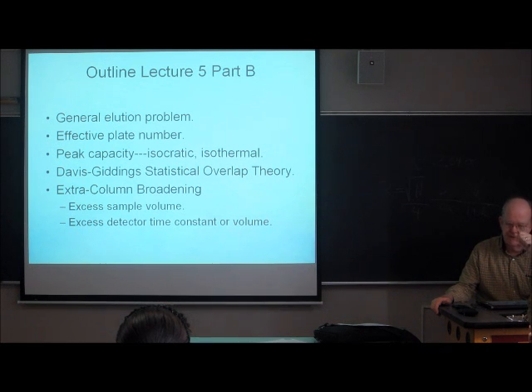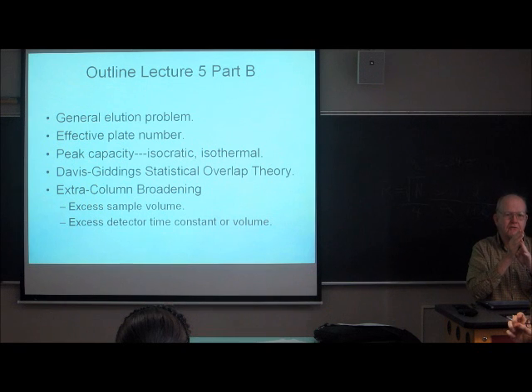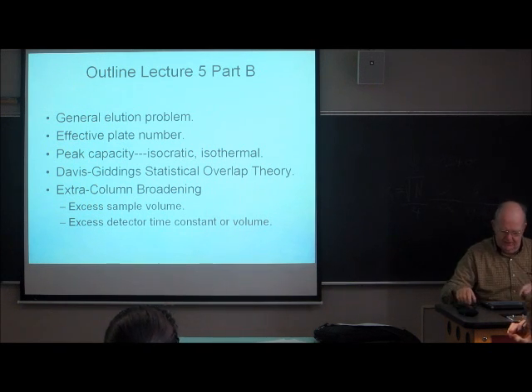And what this theory deals with is how many peaks will you see if the retentions of the sequential peaks are random. That is, they don't come out in lockstep order, equally well resolved, but the peak order, the peak spacing is a random number. And so some peaks are really close together and some are far apart.